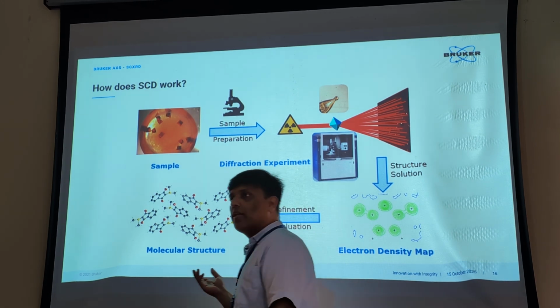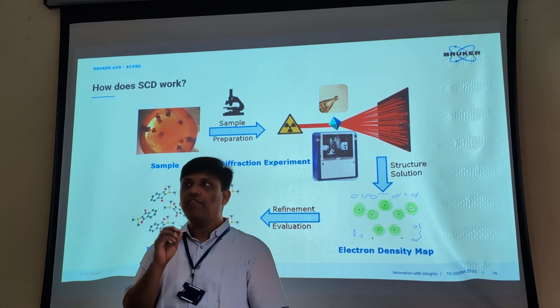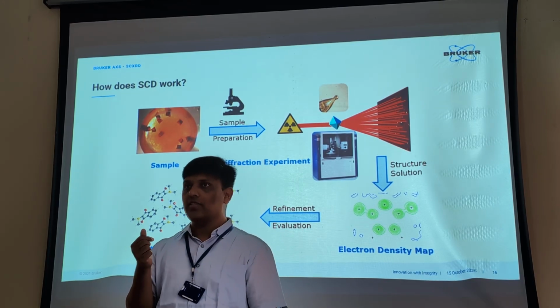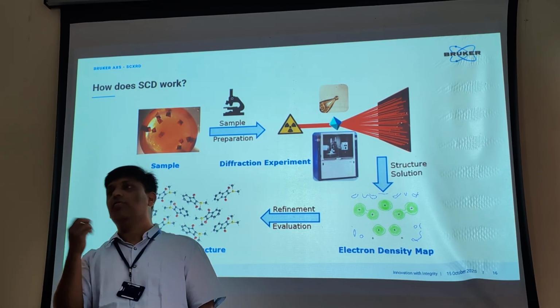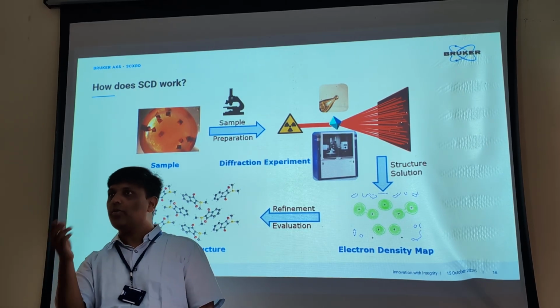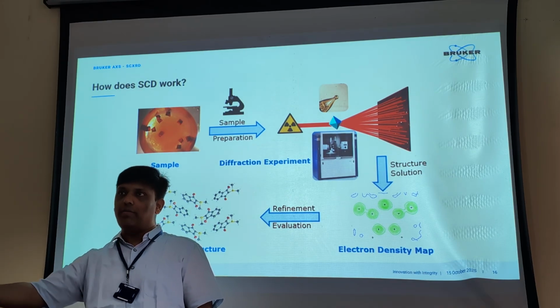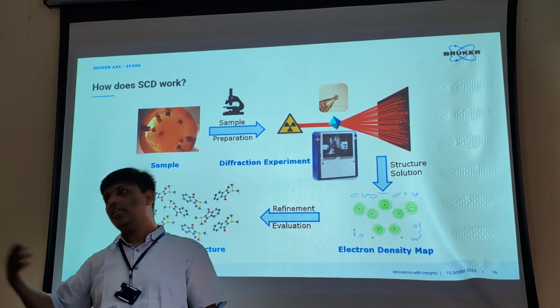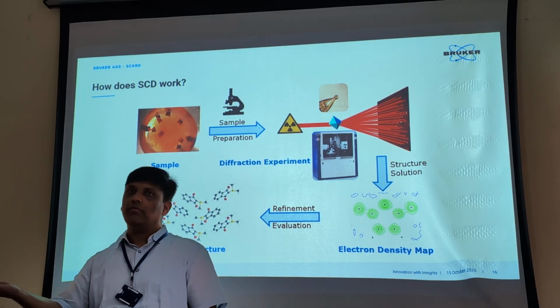Ideally, we would like to have a crystal with the solvent in it. Okay, it's fresh. If it gets dried, sometimes when you are submitting the crystal to the crystallographer or the operator, it looks like a beautiful crystal, but he will not be able to measure on the same day. He will have to wait for the sample queue. Maybe he measures after 2 or 3 days, and when he sees that the crystallinity is already gone, you will get disappointed: oh, what happened?